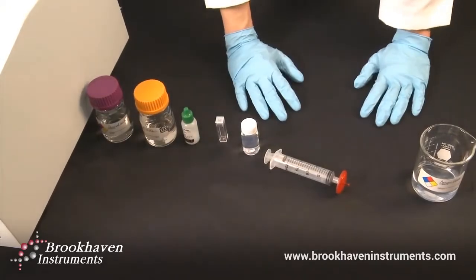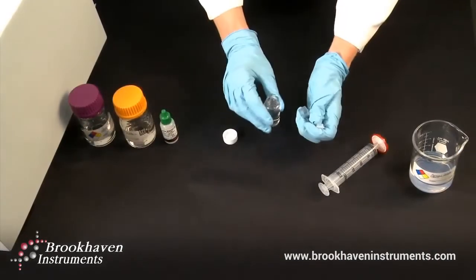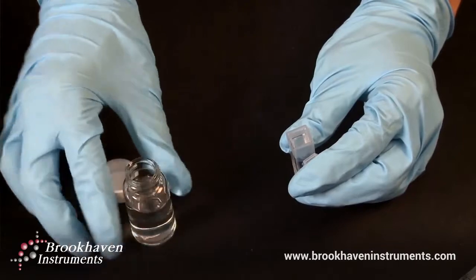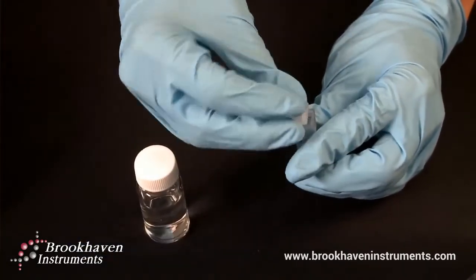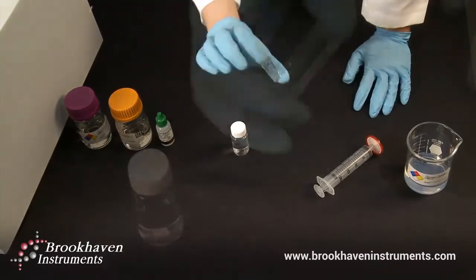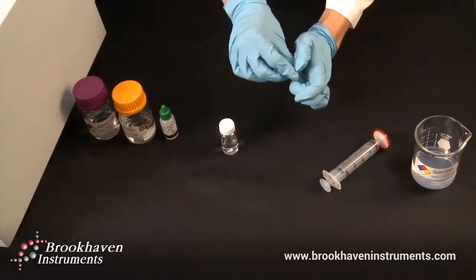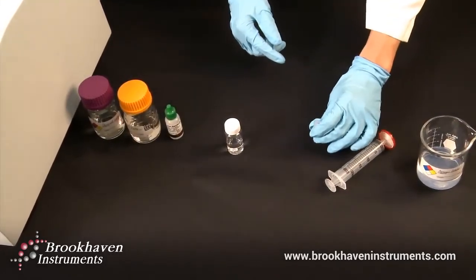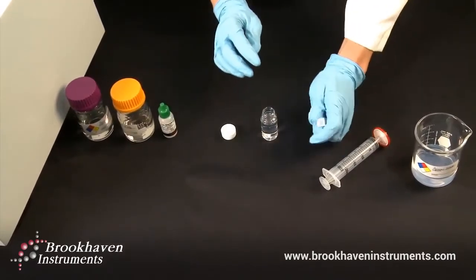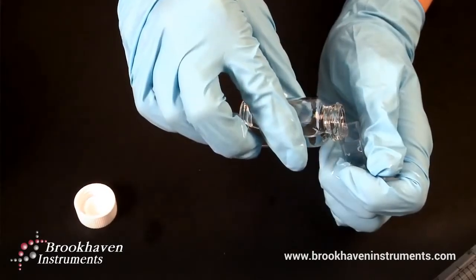Finally, we will prepare and fill our sample cuvette for analysis. Fill your cuvette with filtered 10 millimolar potassium nitrate solution and cap it. Take the cuvette and rock it back and forth to help dislodge any dust attached to the interior of the cuvette and cap. Empty the contents to waste. With our now clean cuvette, pour the 92 nanometer polystyrene latex suspension directly into the cuvette. This is done to avoid another potentially dust-laden surface.